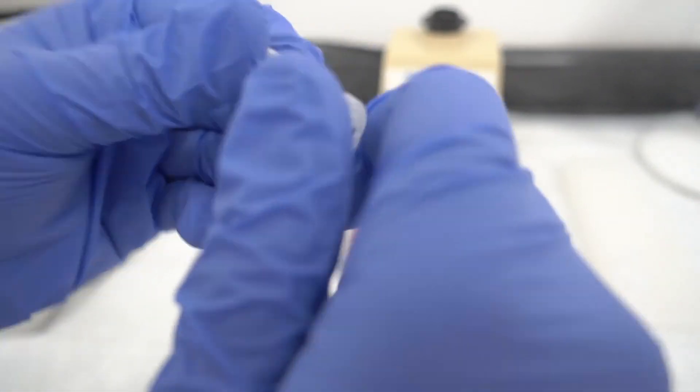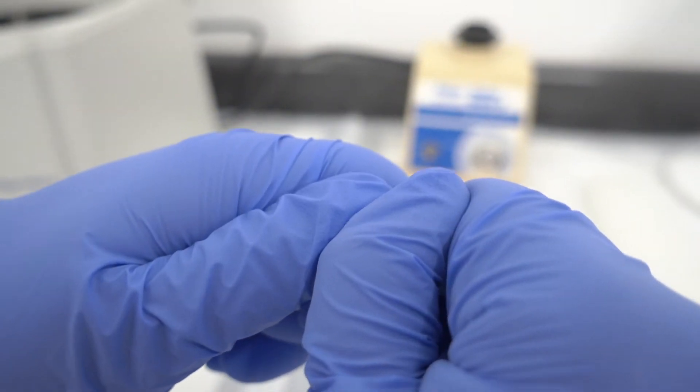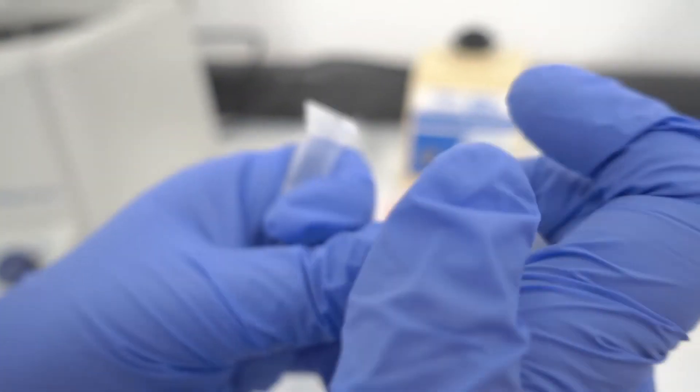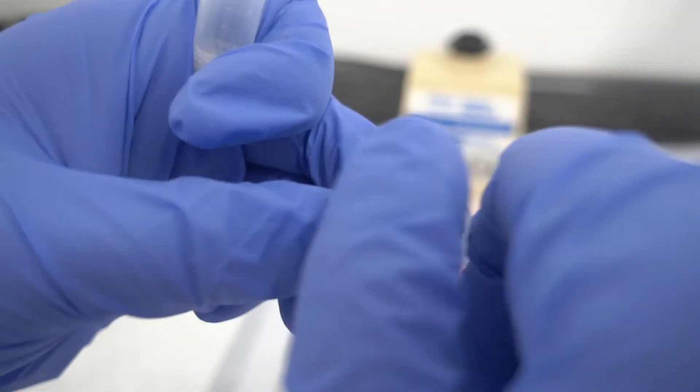As you can see, with the Invent buffer the solution is very sticky and very viscous, whereas with the RIPA buffer it's not viscous at all.